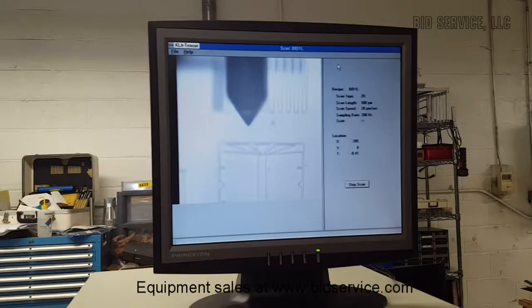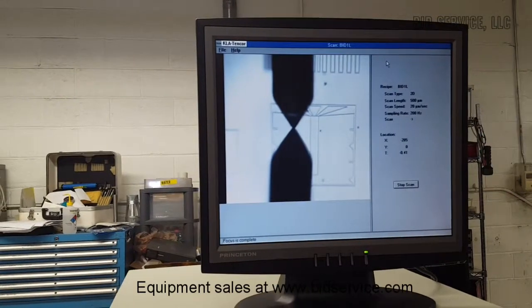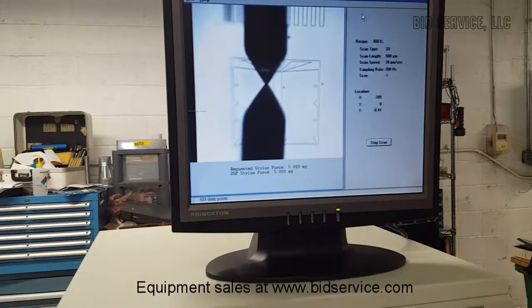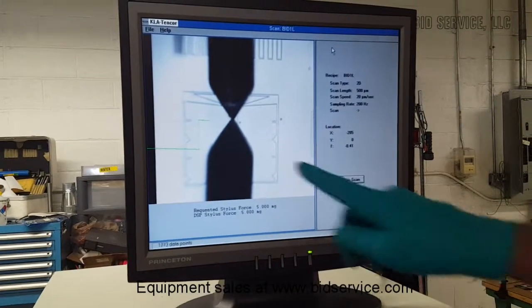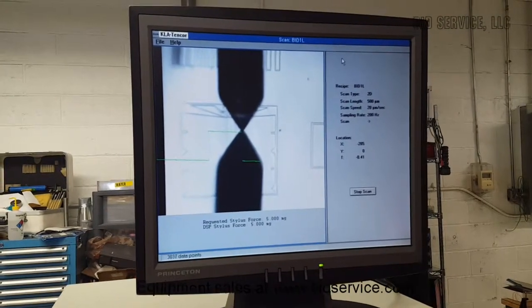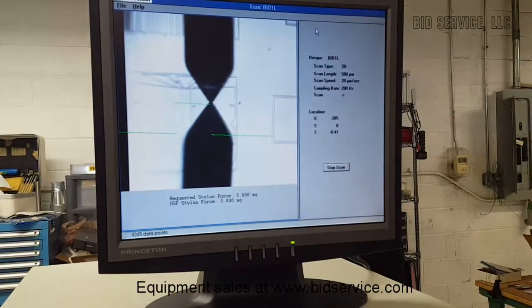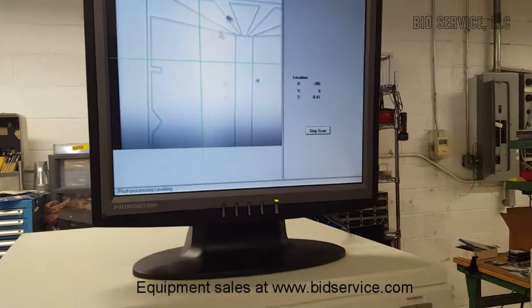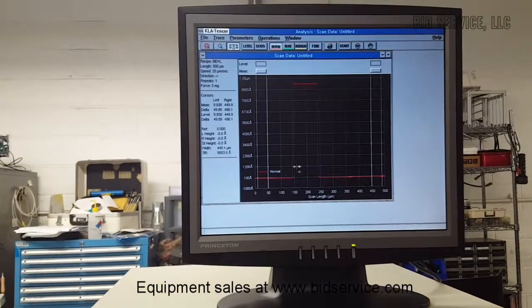Right now the stylus moved up, and then it will go down at the selected speed, and this is touchdown, and it is going to scan. During the scan, a trace will be visible when it starts counting. Right now I have selected the lowest step height measurement level, so you can see it has detected a step. That's the low range scan, and at any point in time the scan can be stopped. So that's the first measurement here.